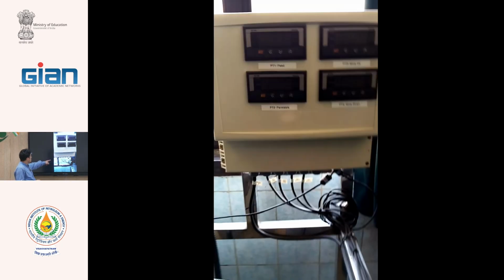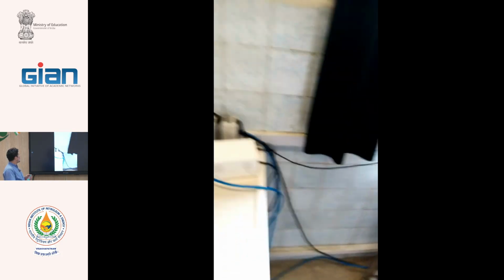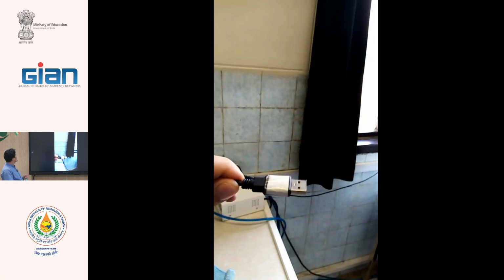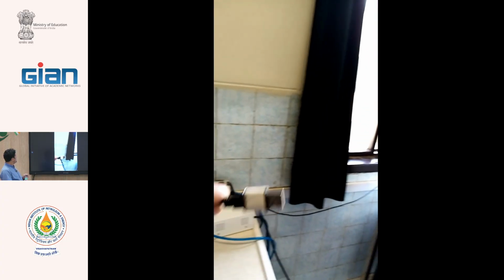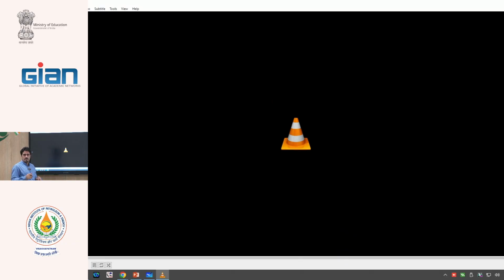We have a USB. This USB can be connected to a laptop for recording of the data. All measured pressures can be recorded on a laptop.